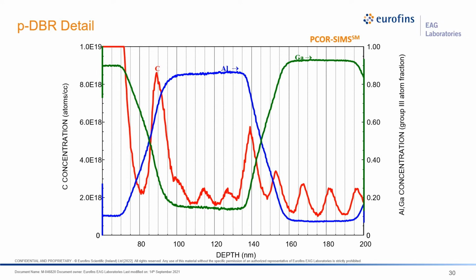And this points to a growth artifact in the epitaxial wafer. And this oscillation seems to be very periodic, possibly because of the rotation of the wafer as it is being deposited. So again, by using a proper SIMS calibration, you can do a failure analysis of these intricate structures.